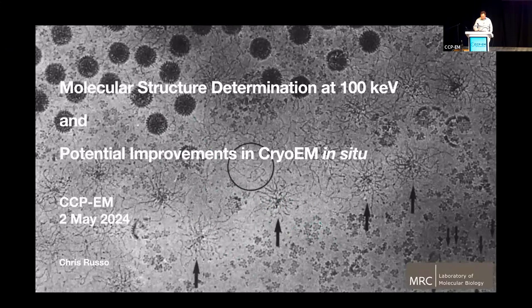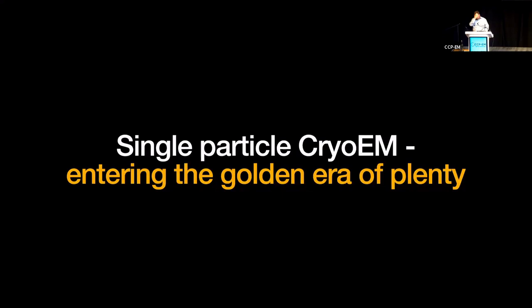So I think if you think carefully about this micrograph, you could see the potential and the power of cryo-EM, but also a lot of the problems that we are still absolutely dealing with on a daily basis, as we've heard about in other talks today. So anyway, I'm going to talk a little bit about our attempts to improve technology in cryo-EM, and in particular, developing a new microscope for single particle cryo-EM.